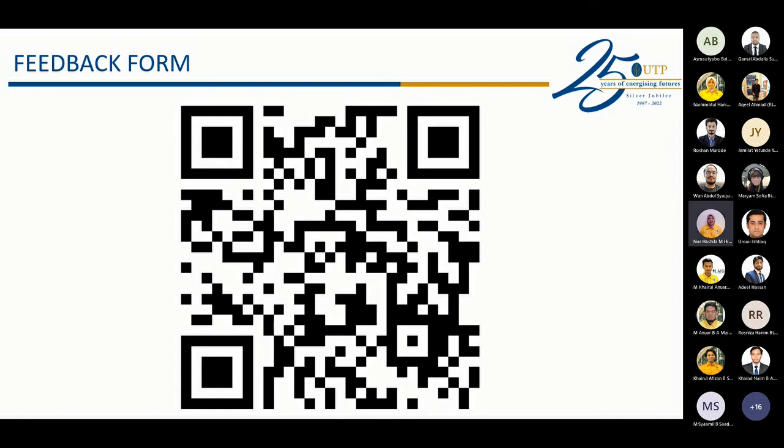One more thing, from the XRD output we can get the crystallite size, and can we also get the particle size? No. And can I simplify that crystal size is smaller than particle size? Particle size doesn't mean it's not crystal, but it might be crystal in this context. In the XRD context, the particle size is made of a few crystal sizes.